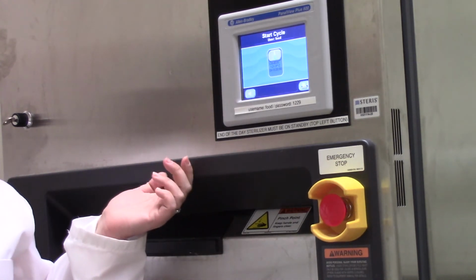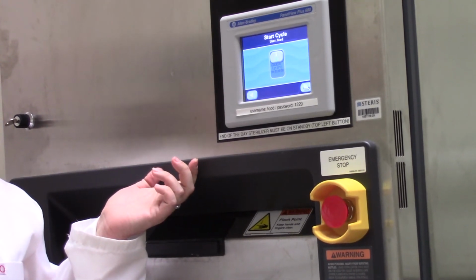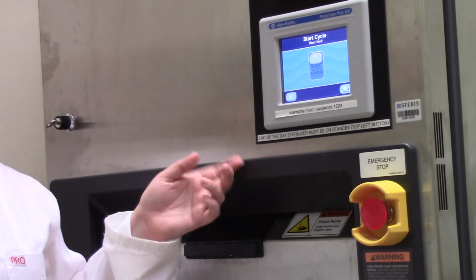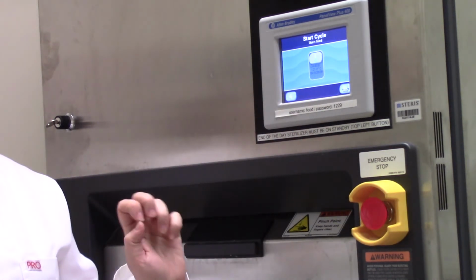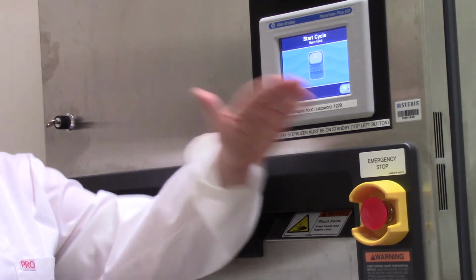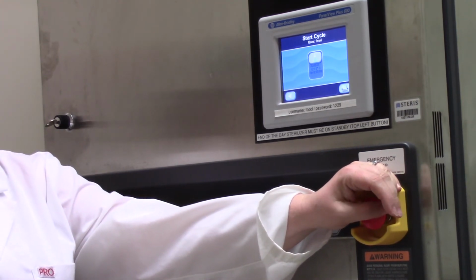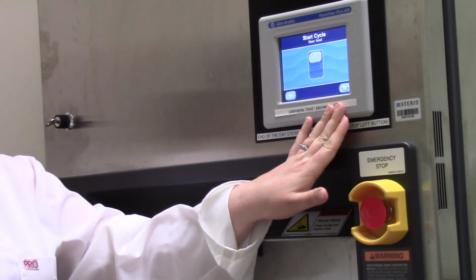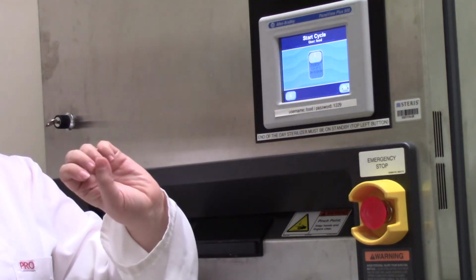Sometimes you get your autoclave started and you realize that, oh shoot, I'm about to run the autoclave for 50 minutes and I forgot to put an item in. If it's something like that, there will be a stop button that comes up on this screen. And that's the one that you want to use for non-emergency situations. The emergency stop button is very hard on the autoclave, so we only use it for emergencies. If it's just little reasons that you need to stop your autoclave, we'll keep to the stop button that's up on this screen.